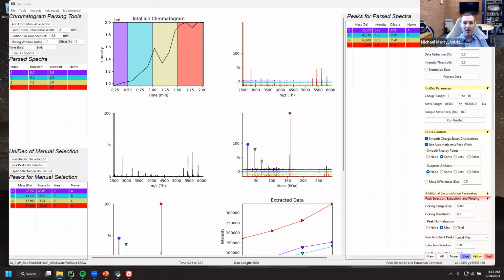Yeah. We just read it in and it's in MetaUniDec, so it just pretends it's the same sort of thing. We just have an X position, a Y position, and a series of scans. We deconvolve it and then reassemble it based on the position data.